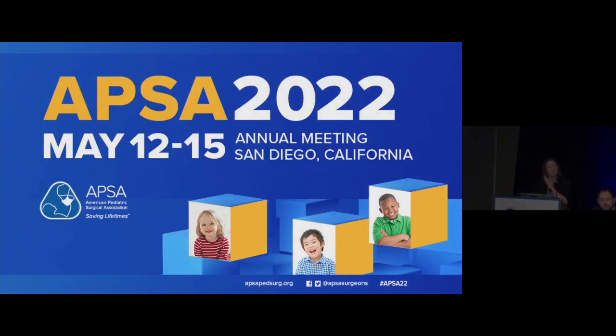Kathy Barsness, Children's of San Antonio. Fantastic work. Thank you. In particular, the challenge is always the scaffold to support a hollow or luminal structure. And I, in particular, really like the one from Carnegie Mellon using the microbeads, the gel beads. What is your resolution? Because your proof of concept looked like it was very thick walled to support. And so what is the tissue thickness that you can get down to but still support within that scaffold? And what is the overall size that you can print at? Because right now you're printing in a very small gel. And is there scalability for that?